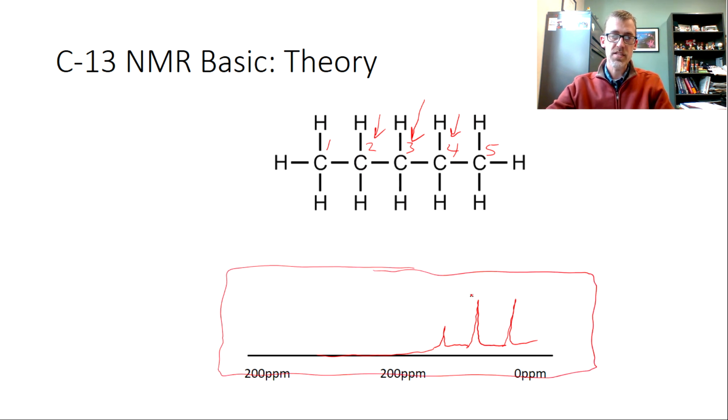And the fact that there is signal, that's meaningful, right? We see 3 signals, but they have meaning in light of what we also don't see. The fact we don't see emission anywhere here tells us that there are things that are not present. We know there aren't carbonyls, there aren't aromatic rings.